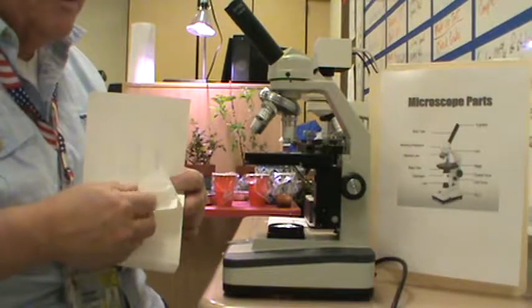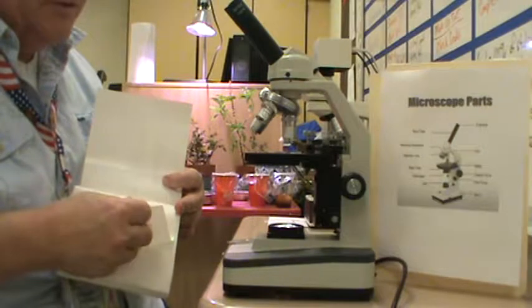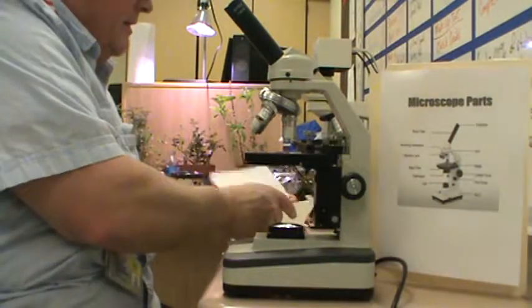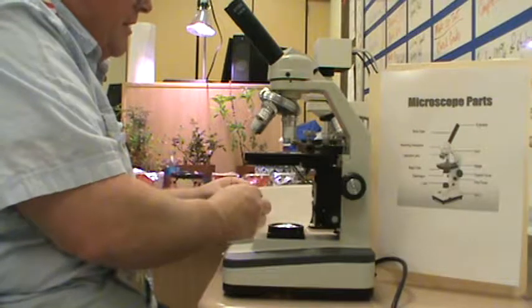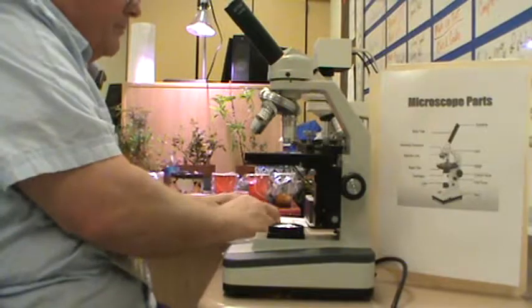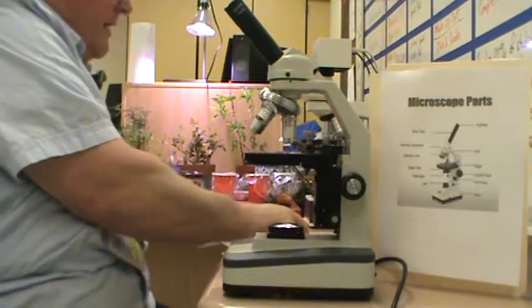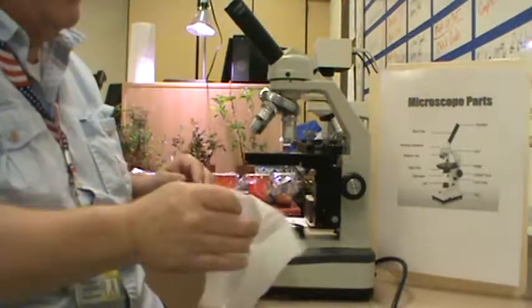How this works, very simply, I'm going to set it down, best thing to do. I'm going to peel off one sheet of this lens paper, pull it out of my booklet just like that. There you go. Very soft.